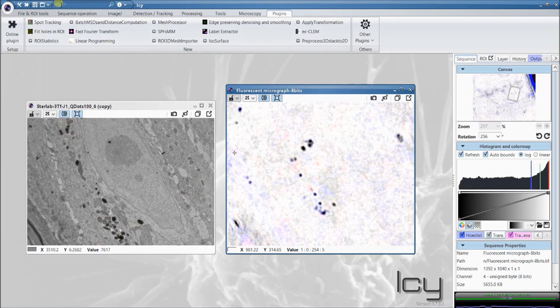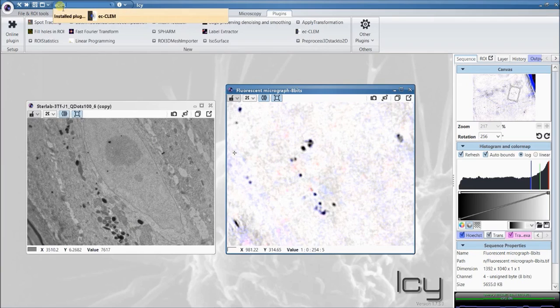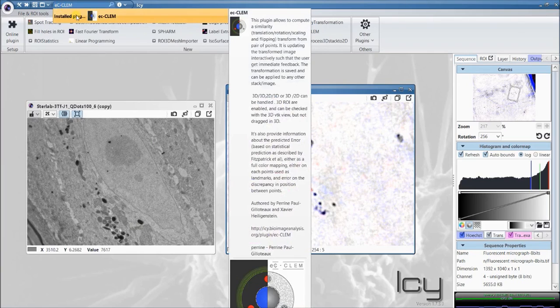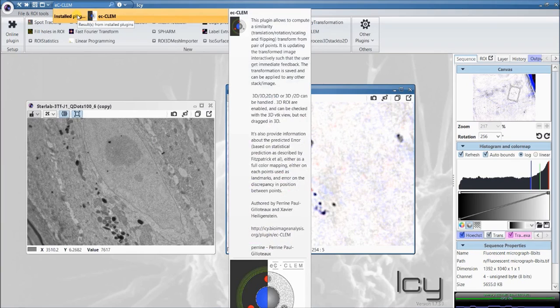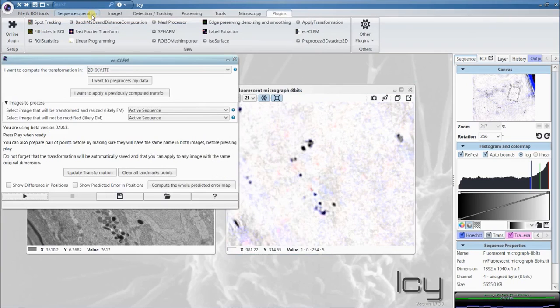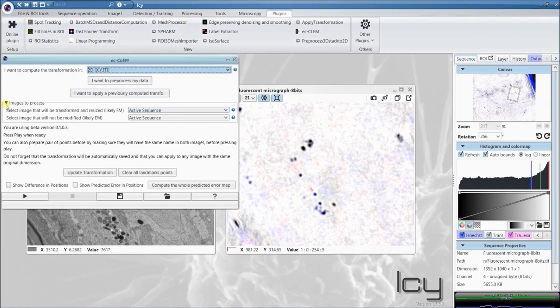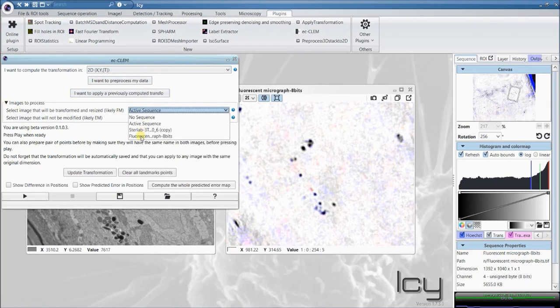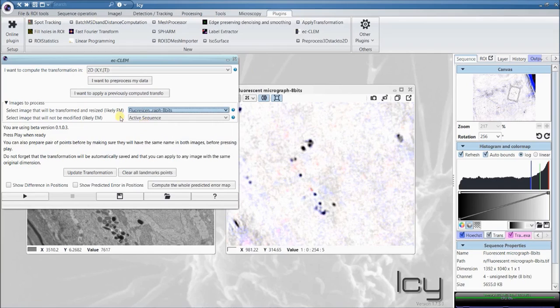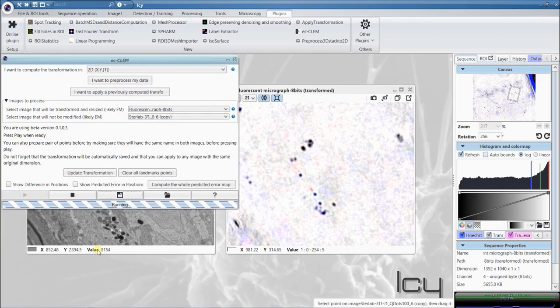Now, type in the search bar ECCLAM. If you don't have it, it will get installed when you click on it. If you have it, it will just launch the plugin. First, select 2D registration. Select the fluorescence images here as the one that will be transformed onto the target image, namely here, the electron micrograph, and then just start the plugin.